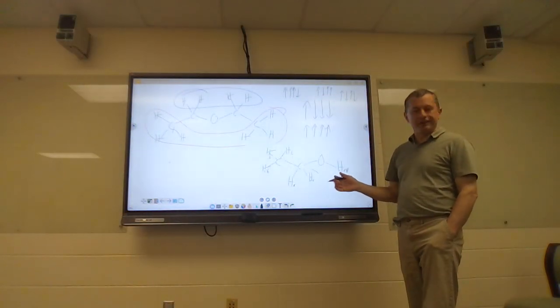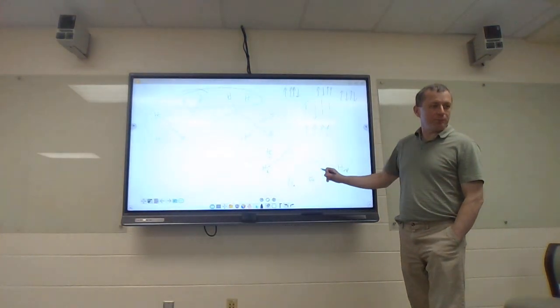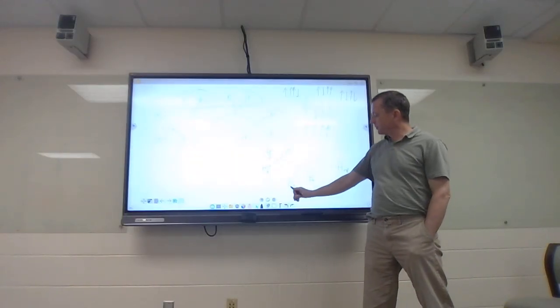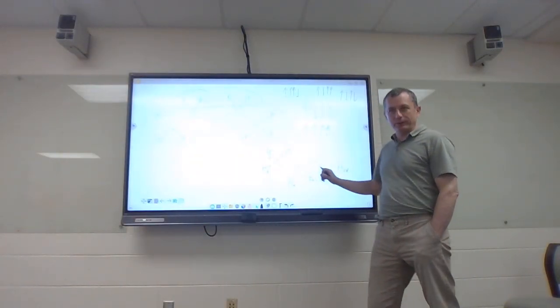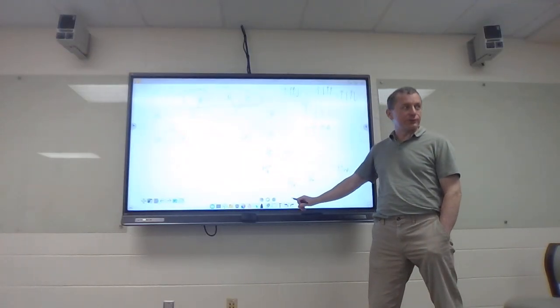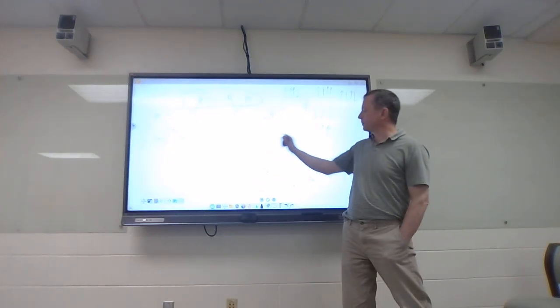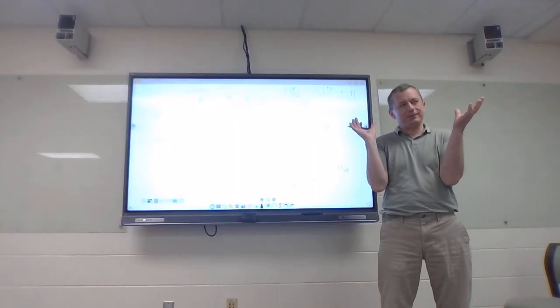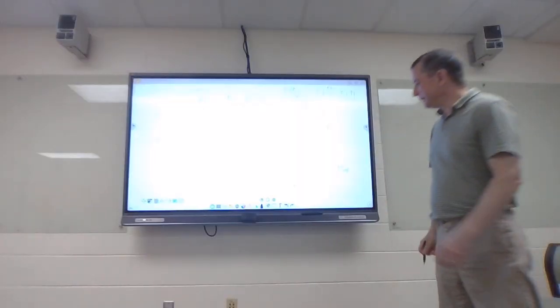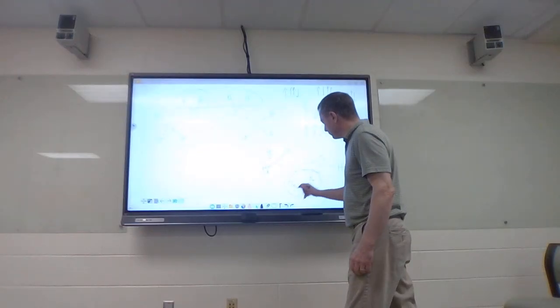And then on each peak, you'd say, okay, this OH you'd associate with the peak at 2.8, 2.77. You'd say the peak that you're seeing at about 3.5-ish there again, you'd associate with these HA protons, or say that they indicate the HA protons. And then finally the one up around 1, you say are associated with the HB protons. I don't care how you label it, or if you like to draw arrows, that's perfectly fine. You can draw lines that connect. But yes, that's one set.